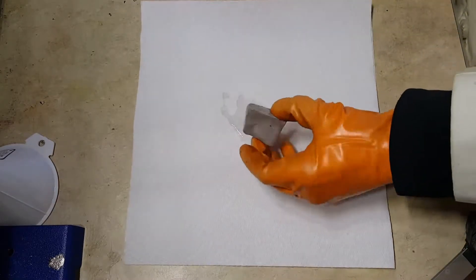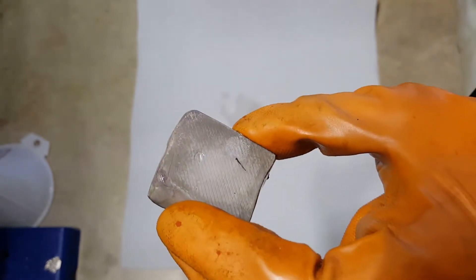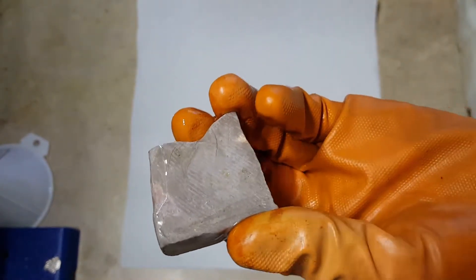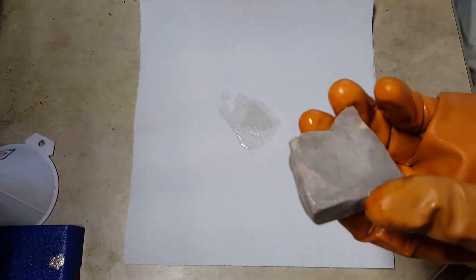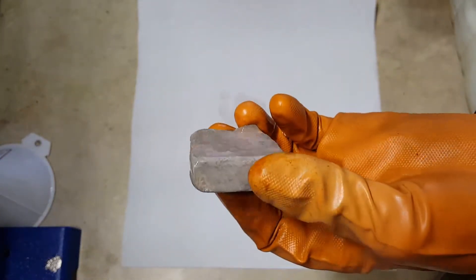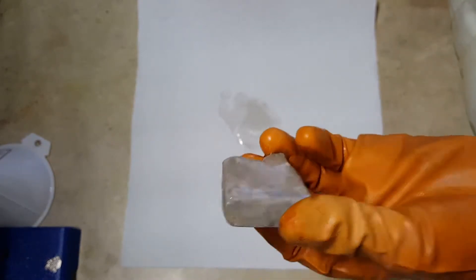So here we have a nice big chunk of sodium. As you can see, the surface is a bit discolored. It's got a coating of sodium oxides, hydroxides, and carbonates because even in the jar of protective mineral oil right there, which it will not react with, some oxygen, some CO2, and some water is going to diffuse through and react with it to form a coating.